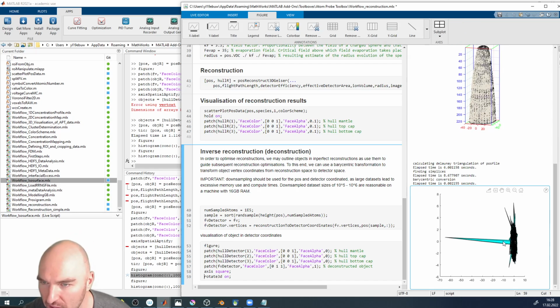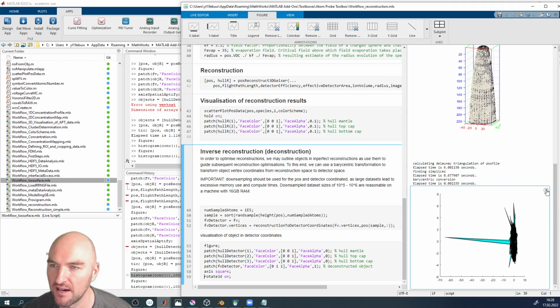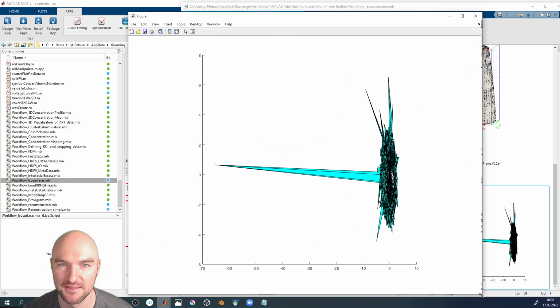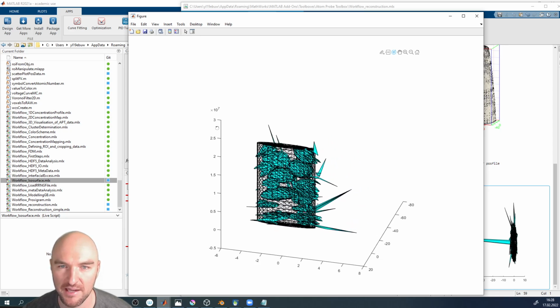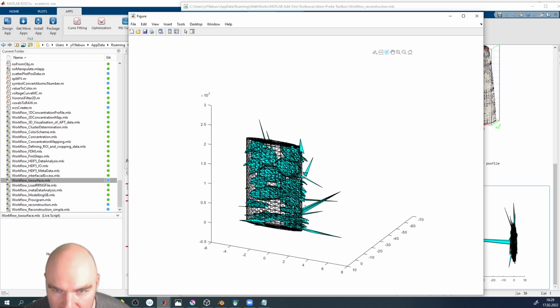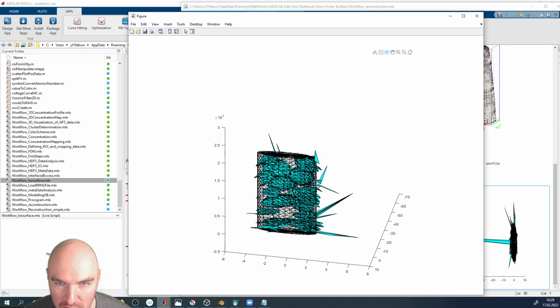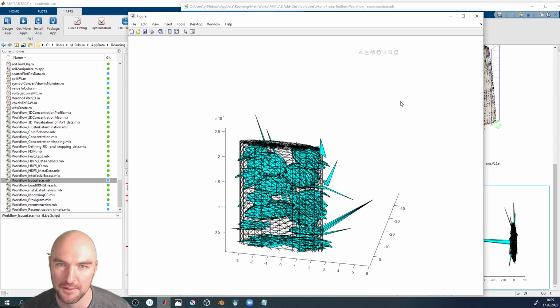And now we have a lot of chaos. Okay, something went wrong. What went wrong? That worked well yesterday. Oh. Some of the vertices are unfortunately very much outside the detector hull, so that's a bit of an issue. But that's not something that's actually that important.